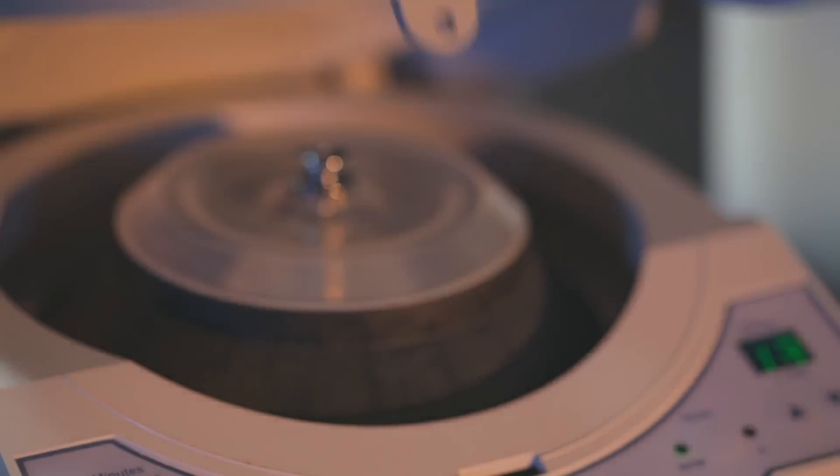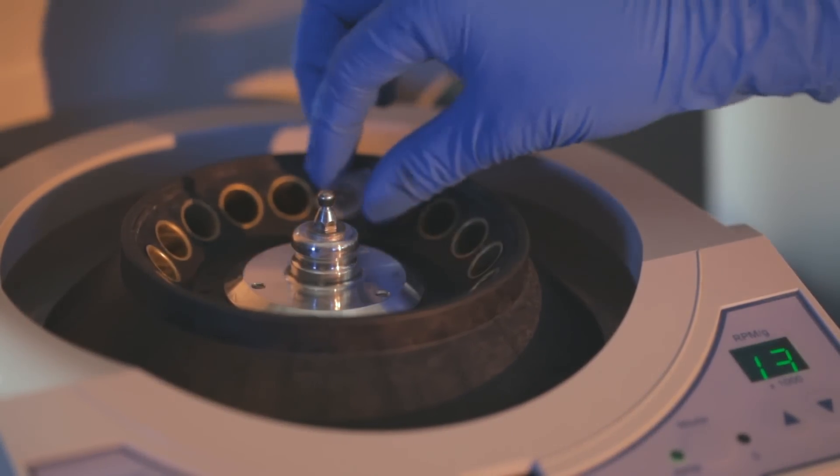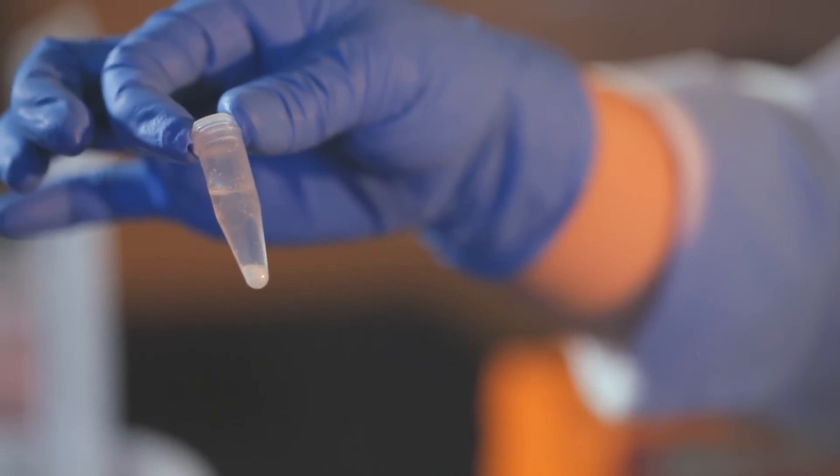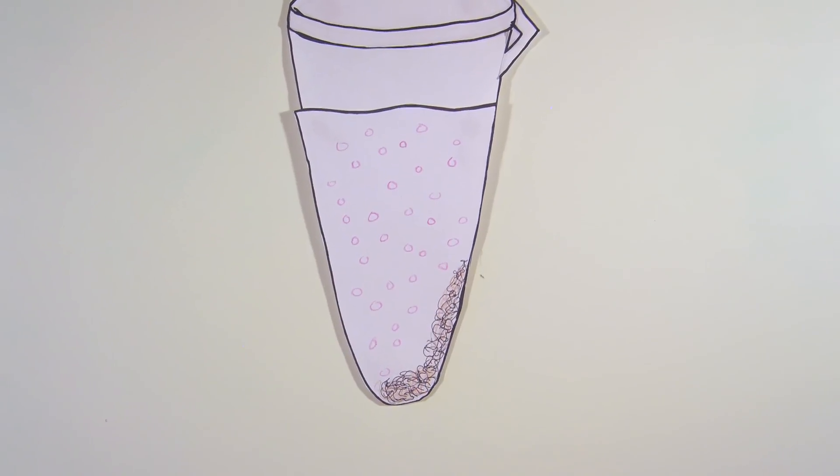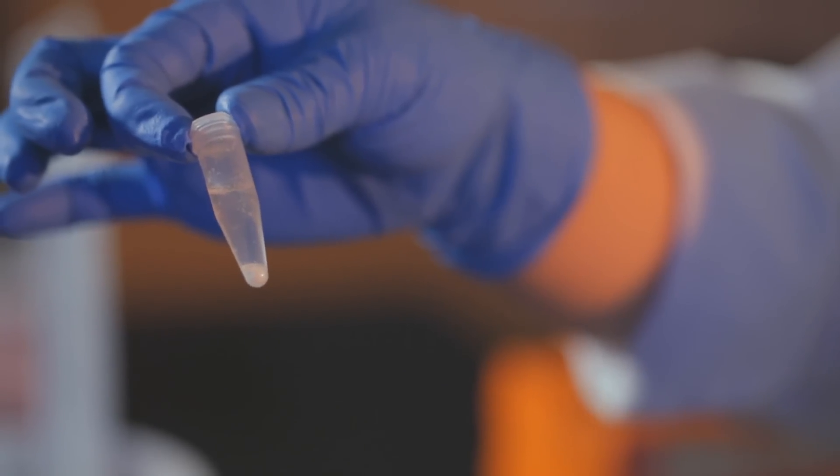After 10 minutes, a white pellet should appear at the bottom and side of the microfuge tube. This pellet consists of the proteins, lipids, and genomic DNA that precipitated out when you added the neutralization buffer. The plasmid DNA that you want is still in solution in the supernatant. The supernatant is what you want to keep.